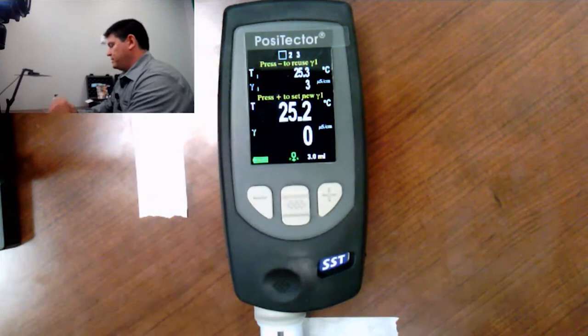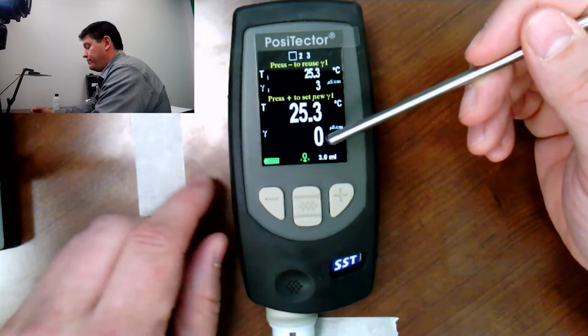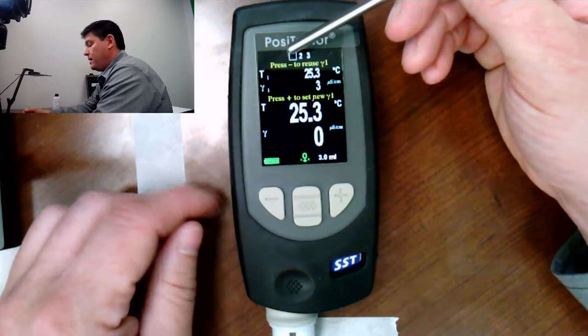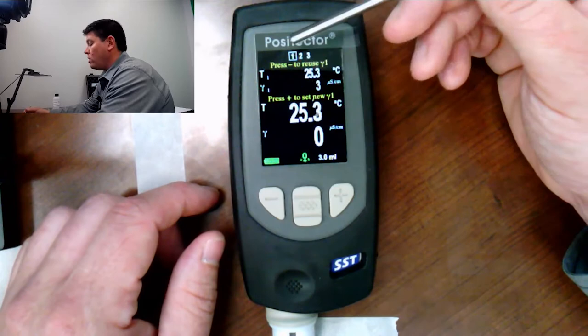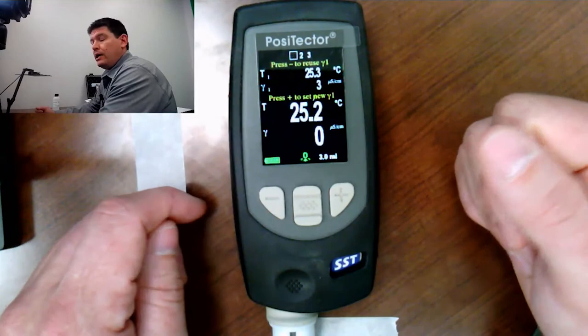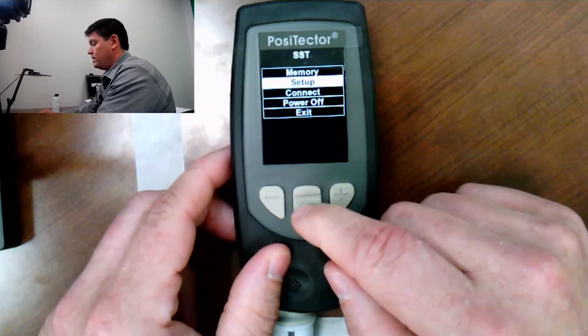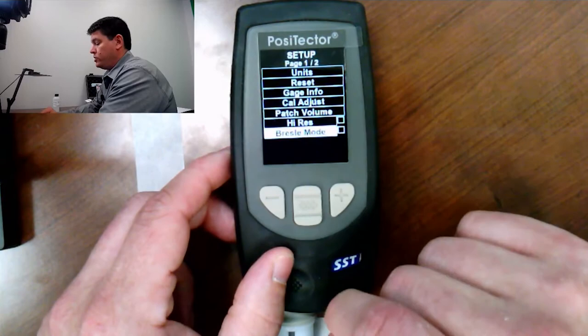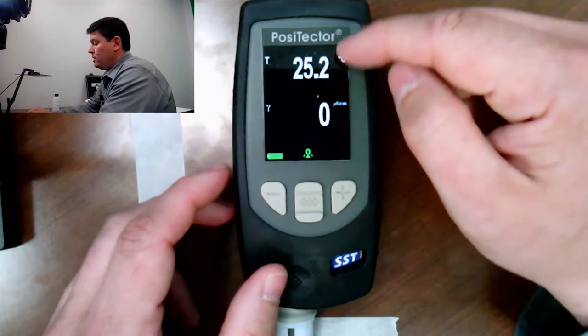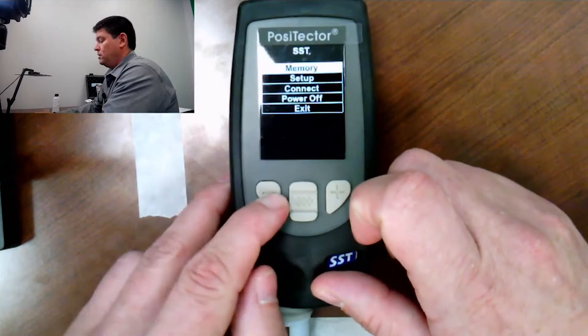Let's talk about the PosiTector SST. You can see displayed on the screen we have a temperature. This zero right here is actually your conductivity, and there's no solution in the gauge right now, so there's no conductivity being registered. You can see up top here we have a 1, 2, 3 — these are the steps of the Bresle method, and the gauge will walk you through each one. The Bresle method essentially is measuring conductivity of the solution placed in the gauge, so this gauge is really a conductivity meter. If you were performing an analysis not related to the Bresle method and wanted to use the gauge as a conductivity meter, that can be accomplished by going into the gauge menu to setup, down to Bresle mode, unchecking the box, and now you just have a conductivity meter. Temperature and conductivity are displayed. To go back, we go to setup, check Bresle mode, and I'm right back to the Bresle method screen.